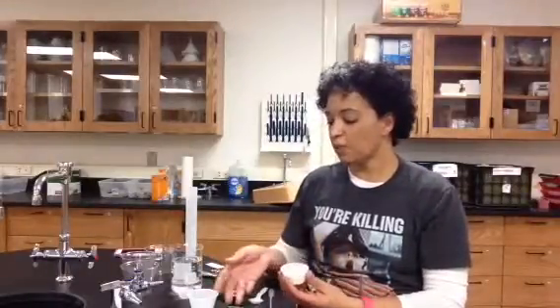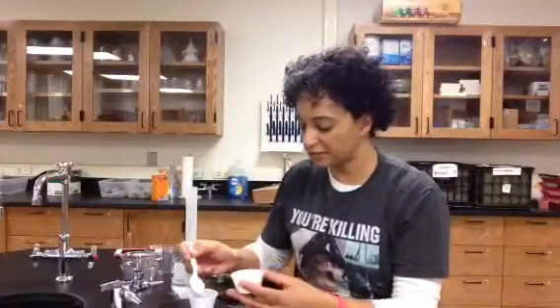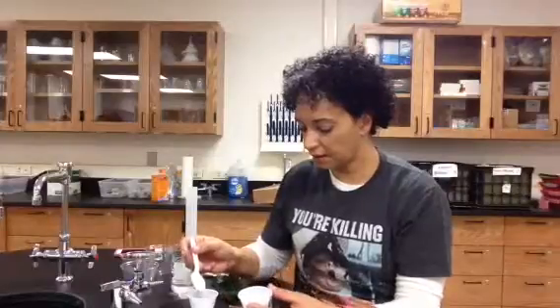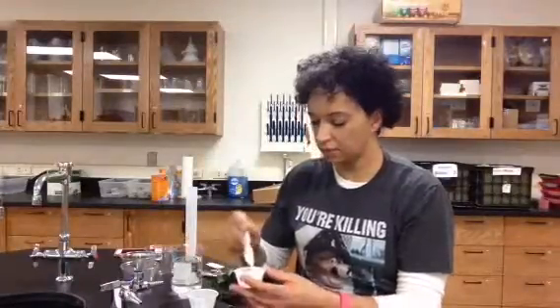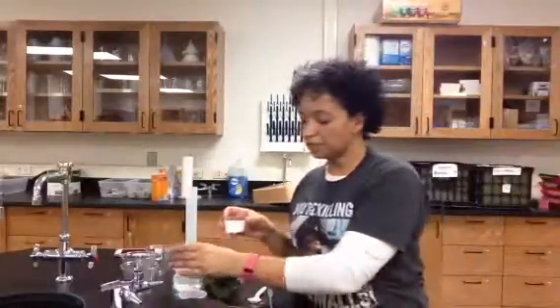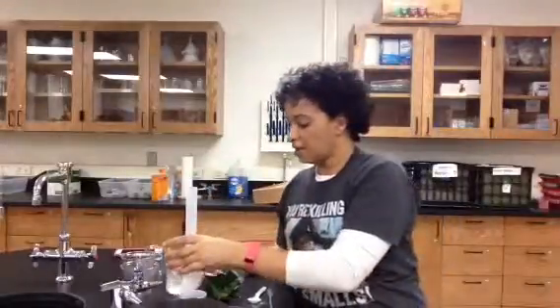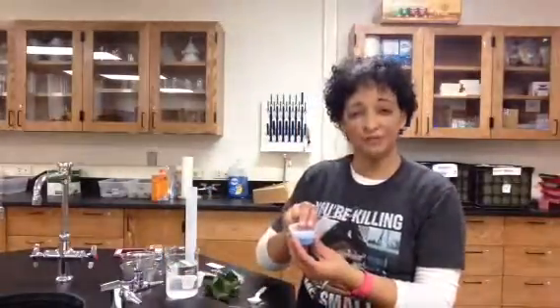And I need 1.5 grams of baking soda. So I'm going to measure out 1.5 grams. It's a very small amount. Okay, almost there, almost there. Come on. Oh, I went past. All right, 1.5 grams. All right, so now that I have my baking soda, I am going to put that into my beaker of water. All right, and I'm also going to get my pipette, and I'm going to get 1 drop of dish soap.